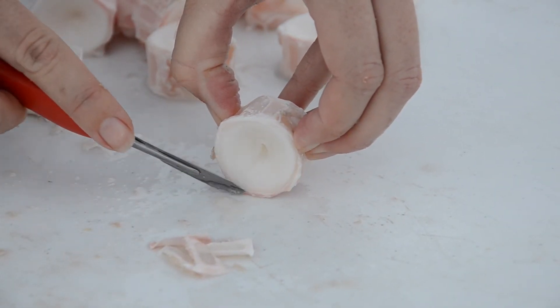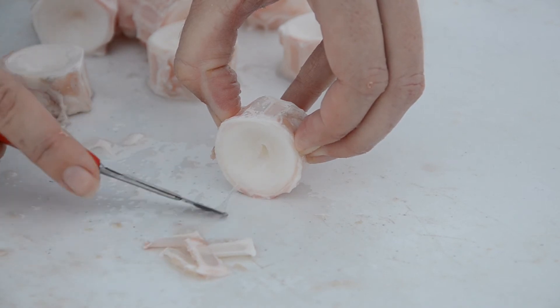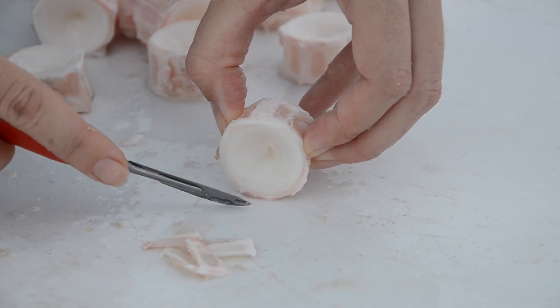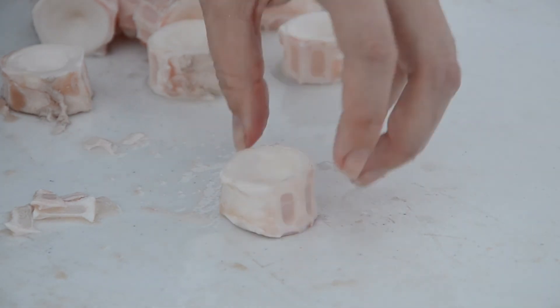For smaller sharks this is actually pretty difficult, so if you have a very small vertebra you almost don't even need to do this step because it's going to go away very quickly with the bleach. It's really only the bigger vertebrae that need it. This vertebral center is now ready to go into the bleach.